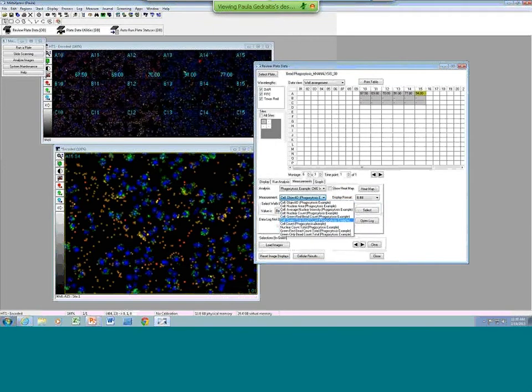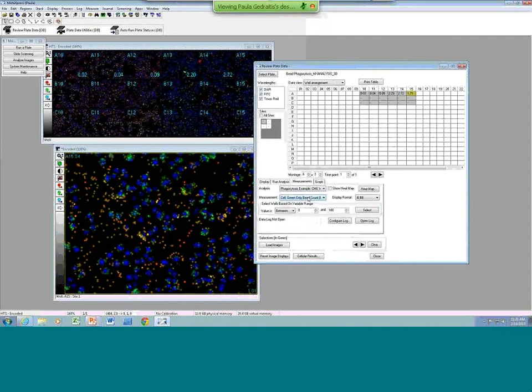My most concern is the green-only bead count per cell, and you can see the difference in the left, the cytochalasin bead treated samples as well as the control samples here. There's definitely a big difference in the output.